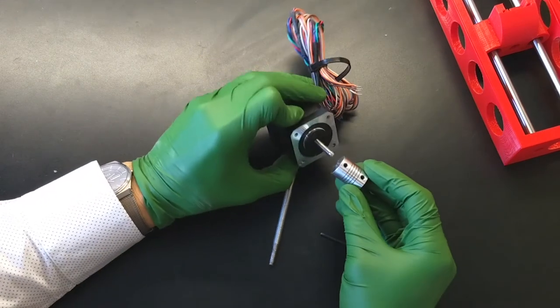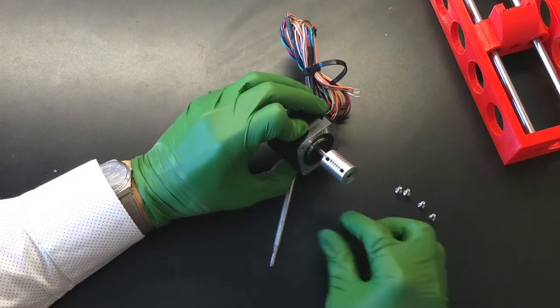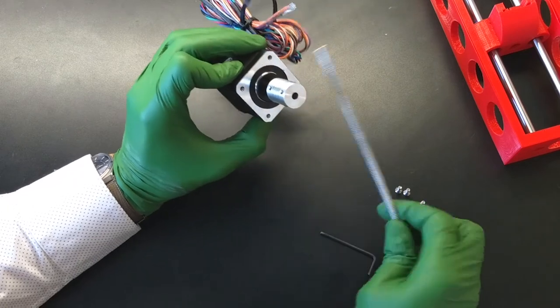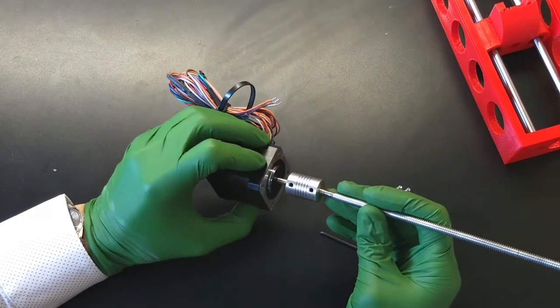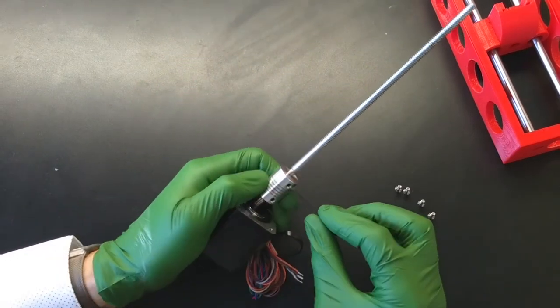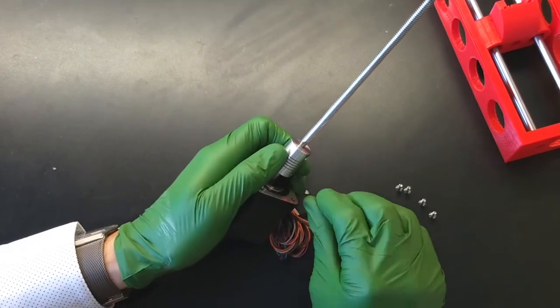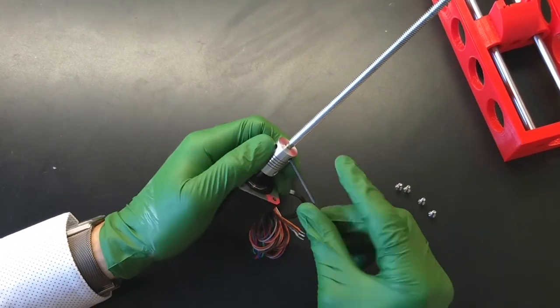Connect the coupler to the motor shaft and insert the threaded rod into the other end. I removed material from one end of the threaded rod using a hardened steel file. It doesn't need to be perfect.